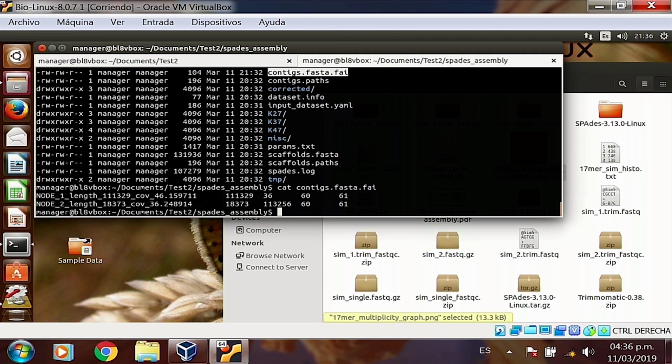So it's telling us about the actual sequence for this sequence, the actual AGTC sequence. It starts on byte 36. The next number is like, how many bytes per line should I extract? It says I should extract 60 bytes per line. And how many bytes are there in every line? There are 61. Why? Because at the end of every line, there's a newline. There's an enter. The enter is also a byte. It's also recorded. That's why it's counting it as an extra byte. But talking about these bytes, things may be a bit confusing.